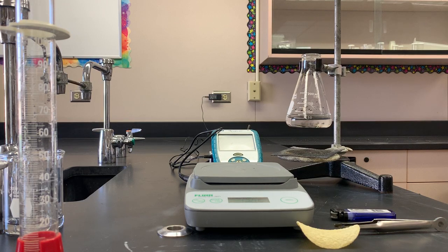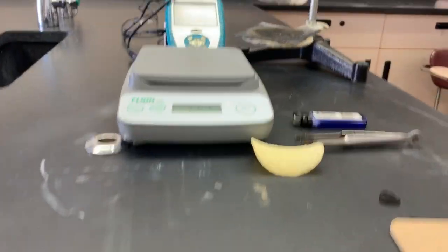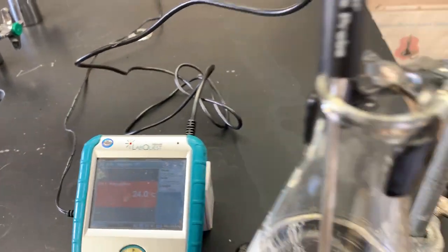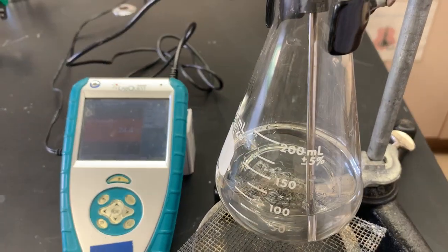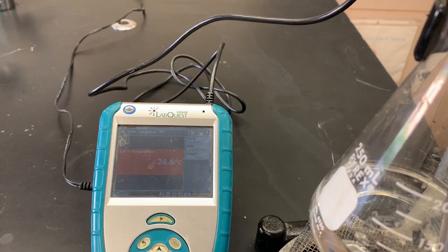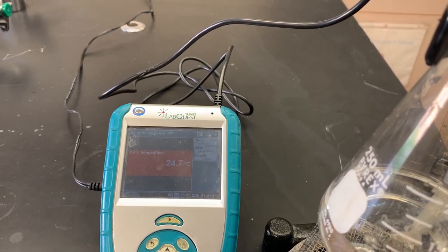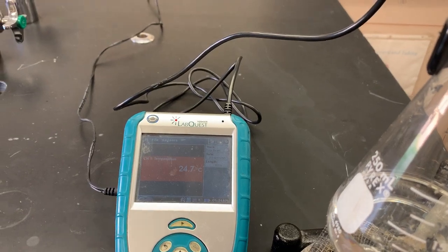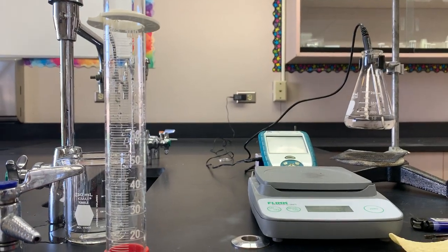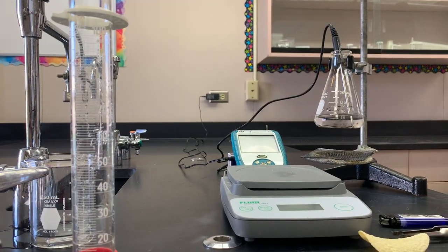Now the next thing we have to do is measure the initial temperature of the water. Currently the temperature of the air is 24.1 degrees Celsius. We'll take the temperature probe, get that into the water, and then see what's going on with the temperature. It looks like we have our initial temperature of water sitting at 24.7 degrees Celsius. So recording the initial temperature of the water: 24.7.